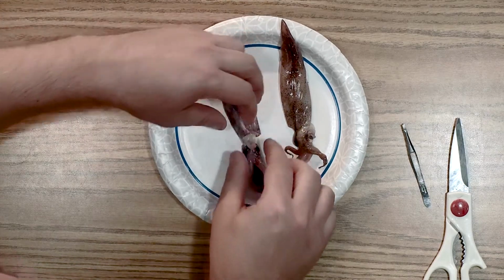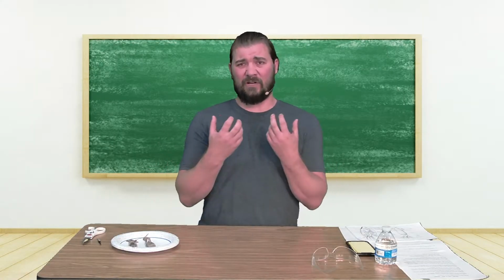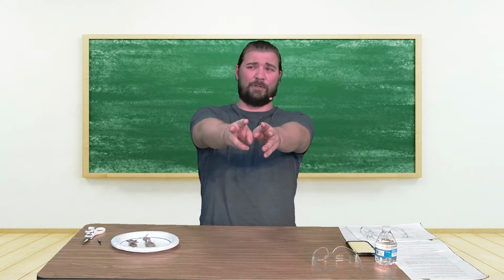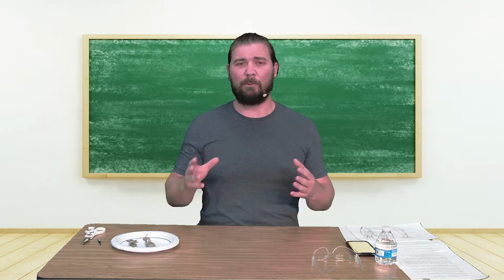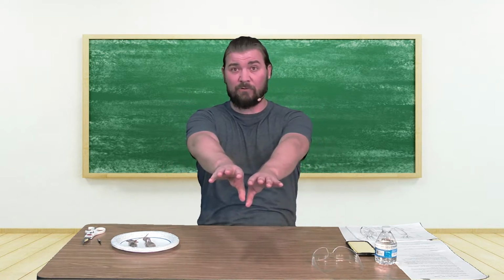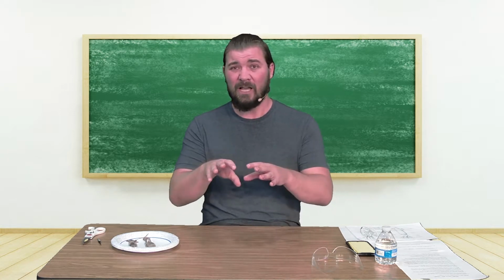And the way that the siphon works is the squid will suck water into its body through one part of the siphon and then shoot it out through that hole, almost like it's a jet engine. And this thing will fly through the water with that in little pulses. It'll breathe in, just like we breathe in, and then push it out through that siphon. Except instead of breathing air, it's breathing in water and pushing it out.